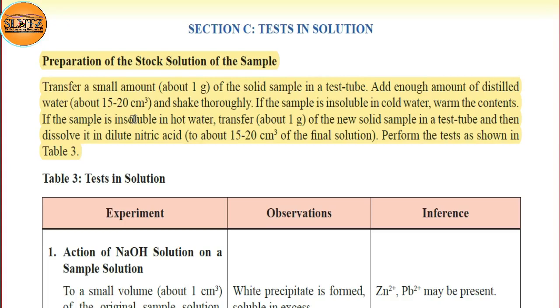So you have to transfer first a small amount of solid sample into a test tube. Then you add enough water, you shake thoroughly. If you see it is soluble, that is a stock solution. But if the sample is insoluble in cold water, you have to warm the content on a flame or on a heat to see if there is at least a dissolution of the sample.